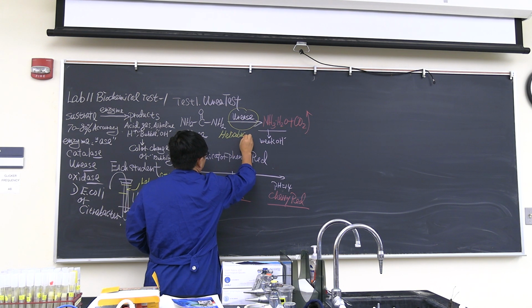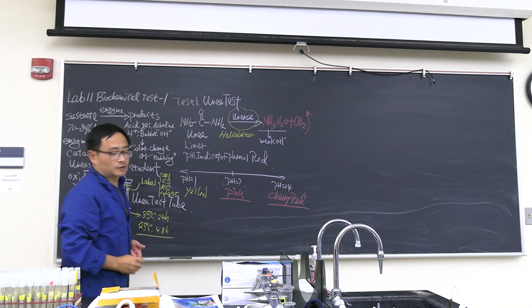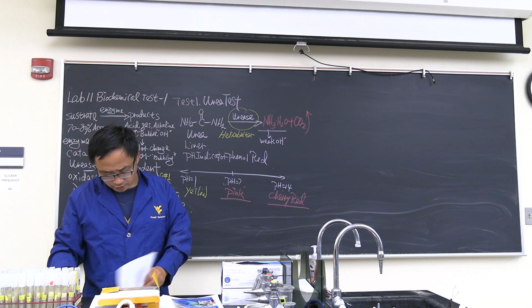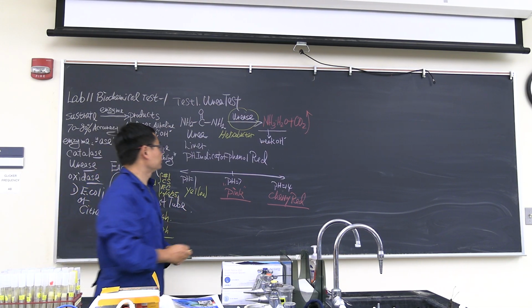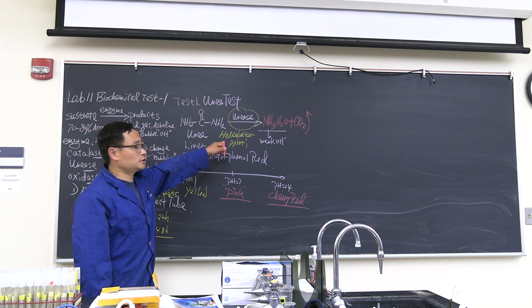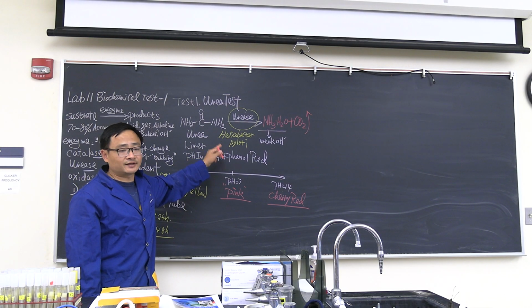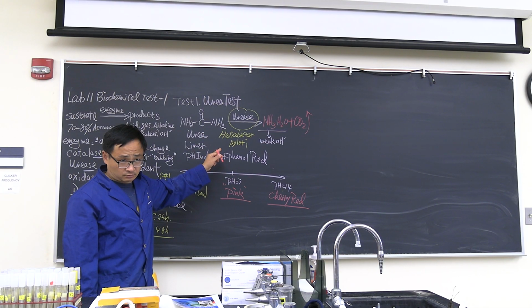Helicobacter pylori. If you look at this one, you will see that. The urea test is very typical for specific bacteria. This is a human pathogen, a severe human pathogen, widely existing in the stomach.